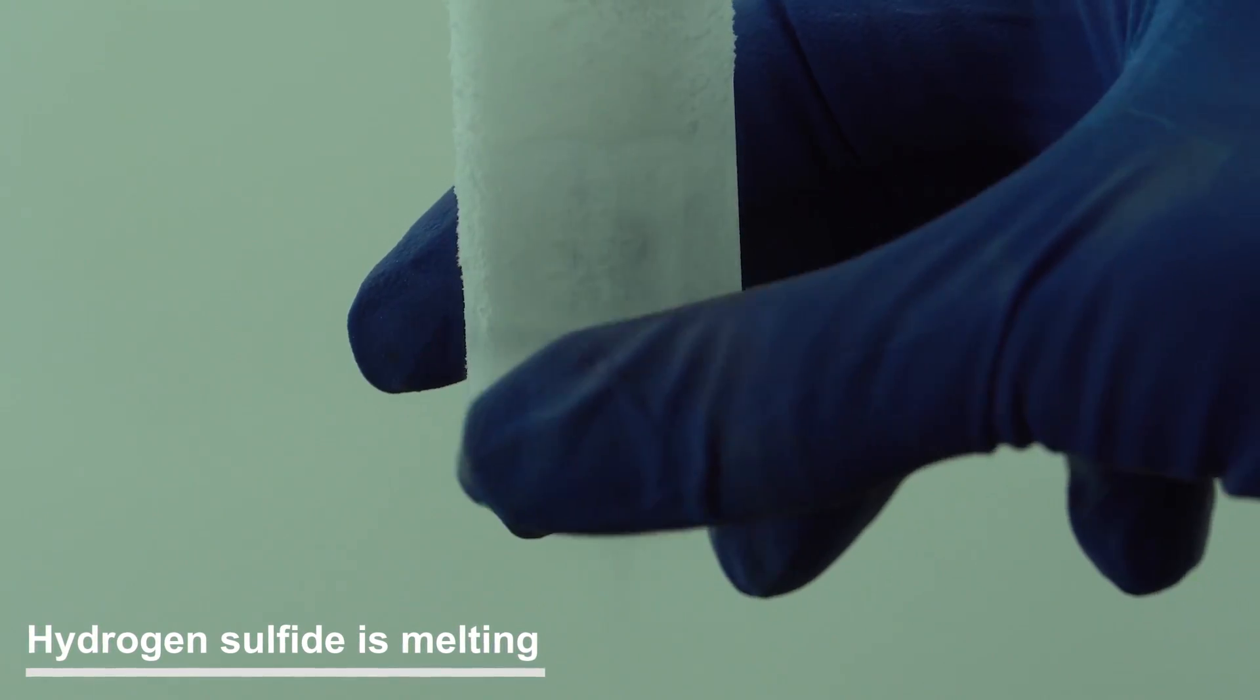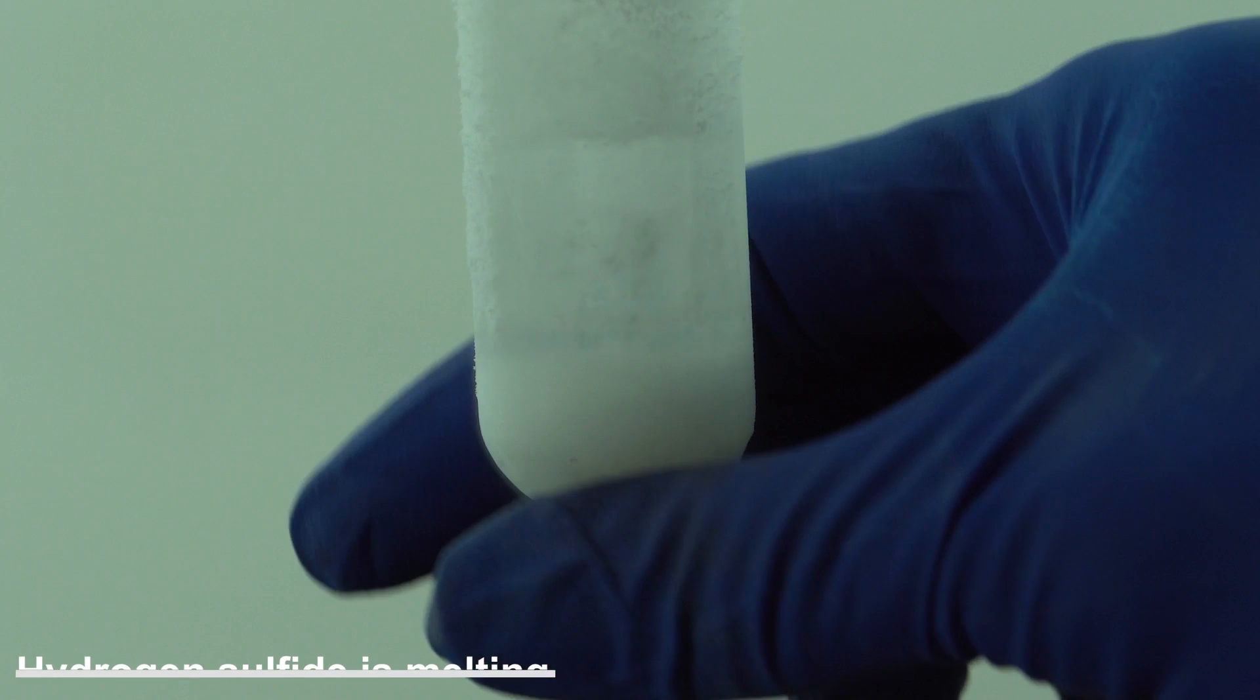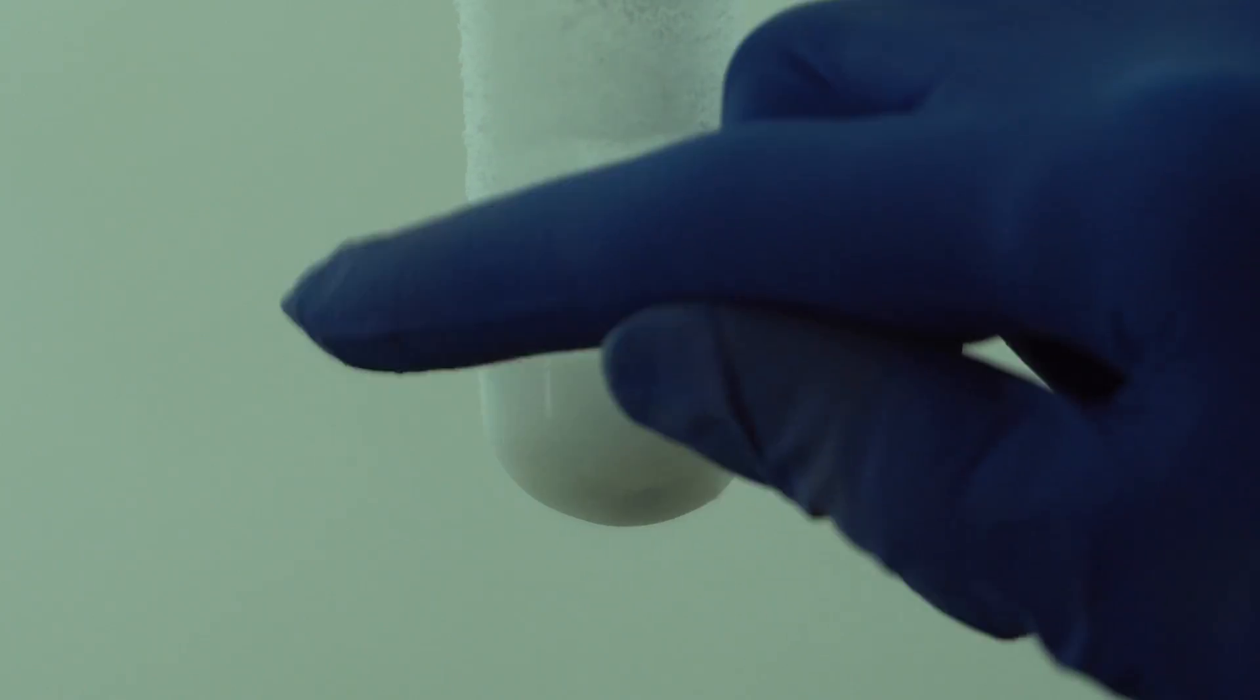Hydrogen sulfide, unlike carbon monoxide, has a higher melting and boiling point. That's why it is much more convenient to store it in a test tube.